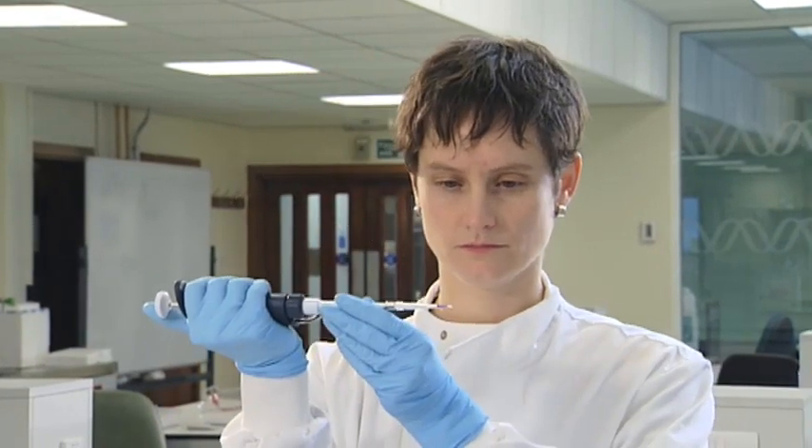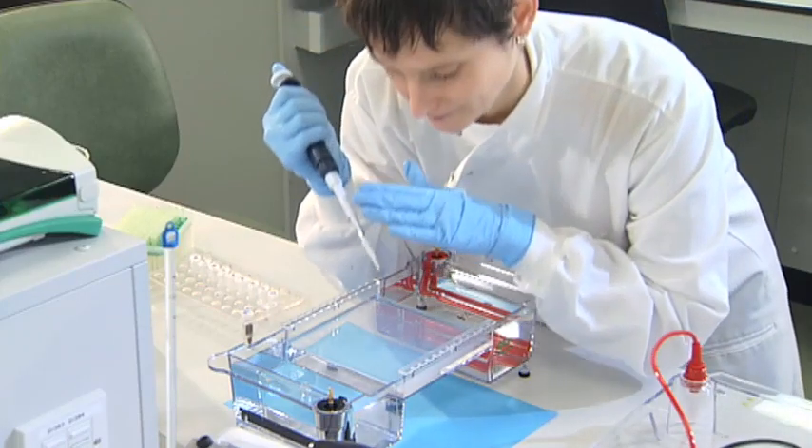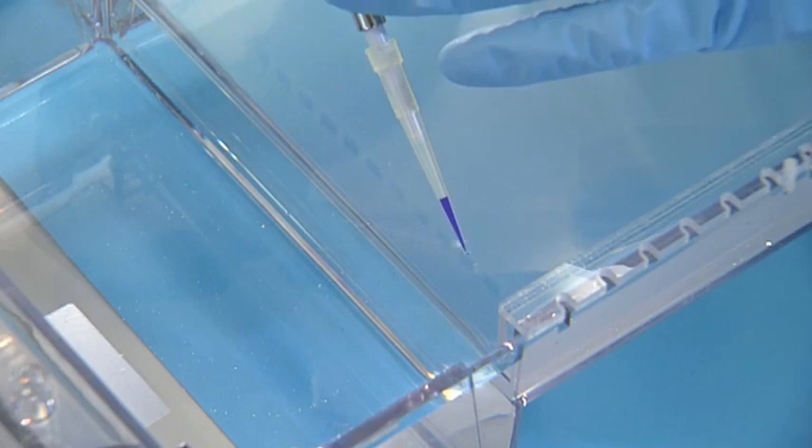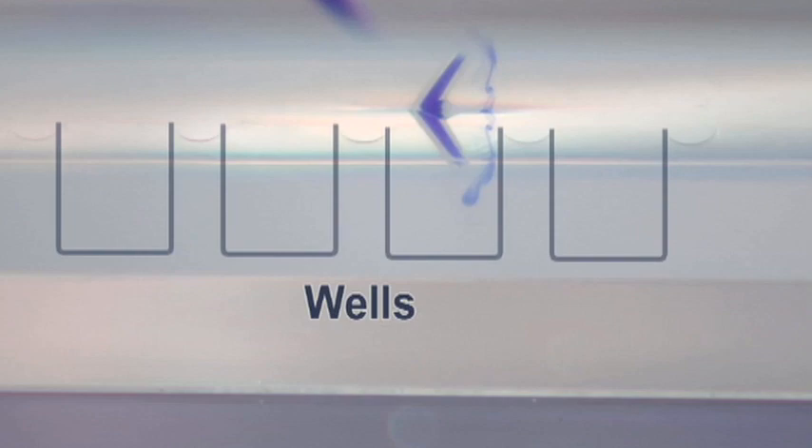Before you pipette the sample into the well, make sure there's no air bubble at the end of the tip. If a bubble is present, gently push down on the push button until the air bubble is gone. Since the wells are rectangular, keep the pipette parallel to the row of wells when loading the samples. This orientation reduces the possibility of accidentally stabbing the walls of the wells.